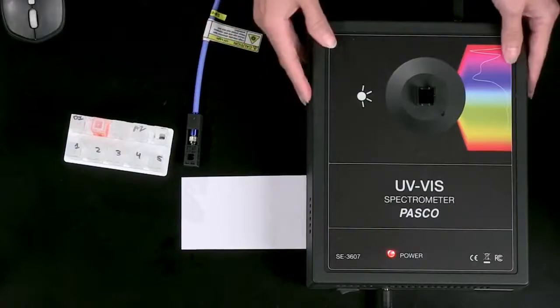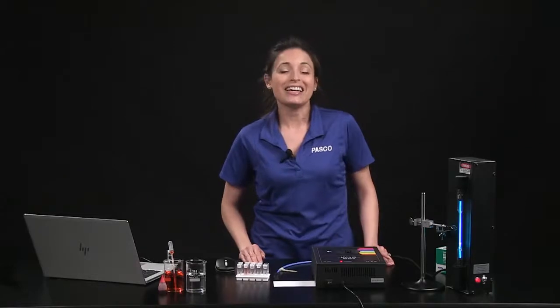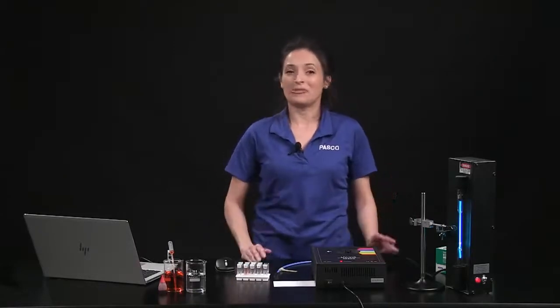With PASCO's UV-VIS spectrometer, you can investigate the invisible properties of solutions, chemical reactions, light, and atoms across a wide range of wavelengths.